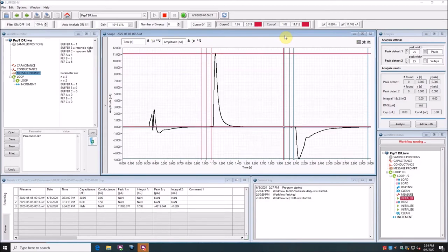Let's have a closer look here. Injection of non-activating solution starts at 0.3 seconds of the time axis. There are a few peaks, mechanical artifacts, but the baseline current is achieved shortly after. After the time point of 1 second, the internal valve switches to inject activating solution, which arrives at the sensor about 80 milliseconds afterwards. At this time point, we measure proton translocation by PEPT1 induced by 20 millimolar glycyl-glycine.